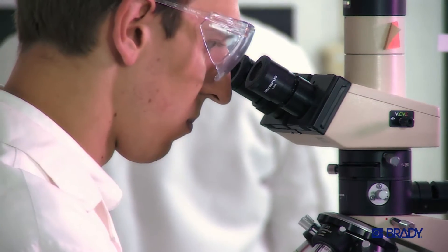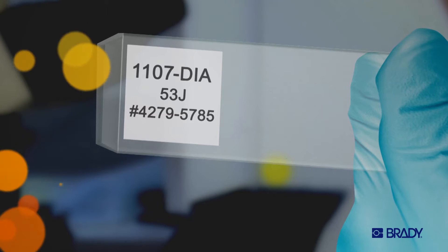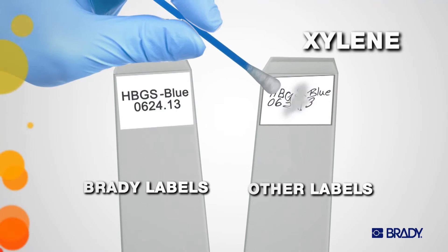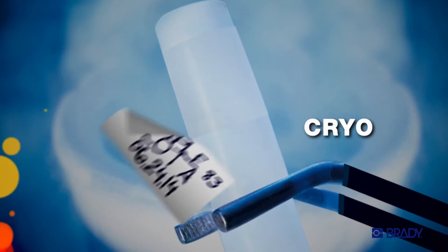Think about it. When you're working in the lab, proper identification and labeling is critical to organizing and protecting research. A little drop of ethanol, xylene exposure, even cryo — they can all spell disaster in a heartbeat.